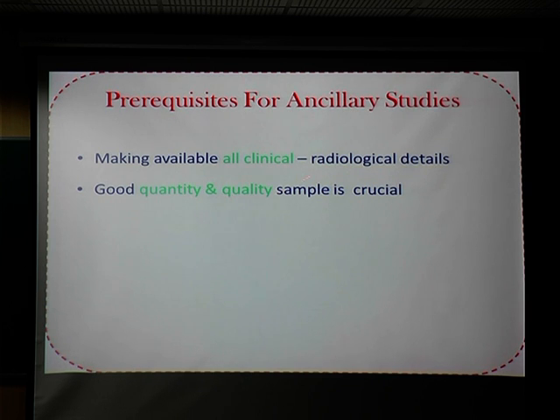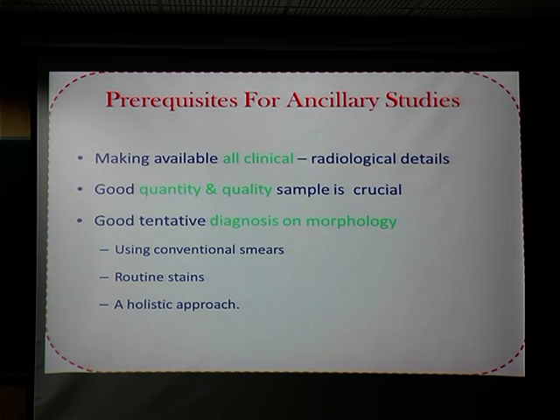It's a joint responsibility. The quality of the sample, it is our responsibility. Once it comes to the lab, we have to be really fast to process it and not keep it there on the rack lying down for say a day or two, and then think of processing it. So you have to process it pretty fast.